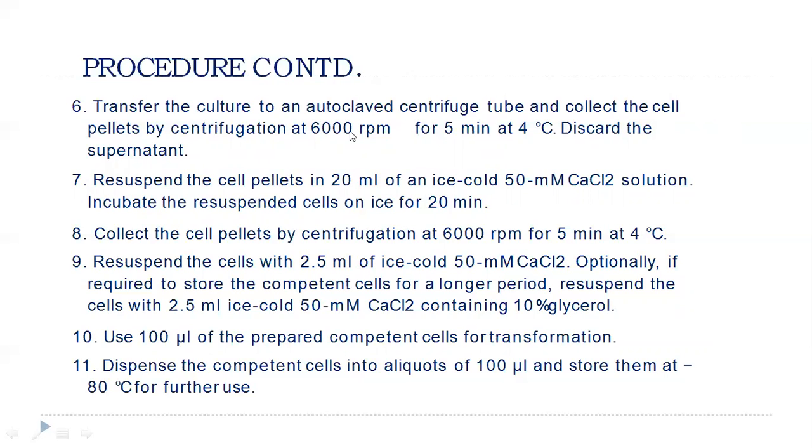You just centrifuge the cell suspension and it will make a pellet of the cells, and resuspend the pellet, which is at the bottom of the centrifuge tube, in 20 ml of ice cold 50 millimolar calcium chloride solution. So incubate the resuspended cells on ice for 20 minutes.